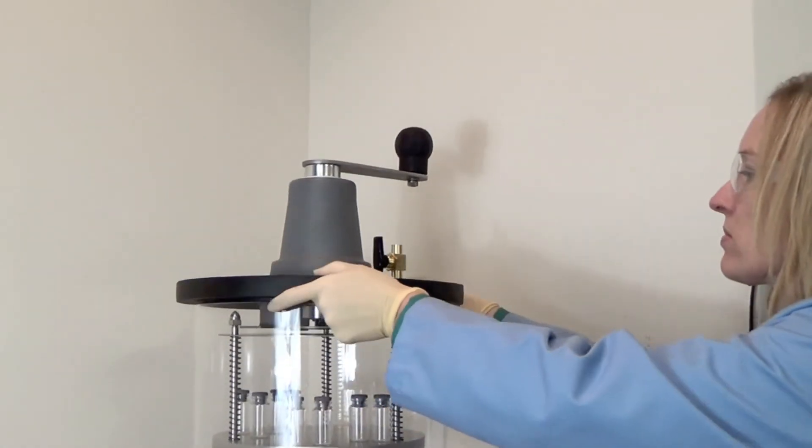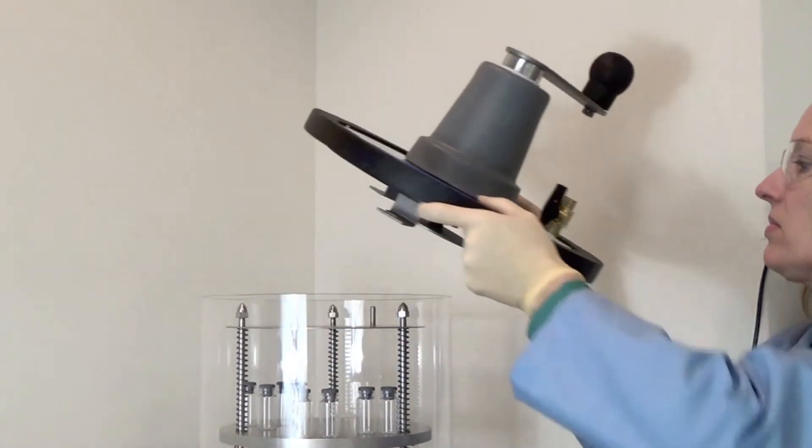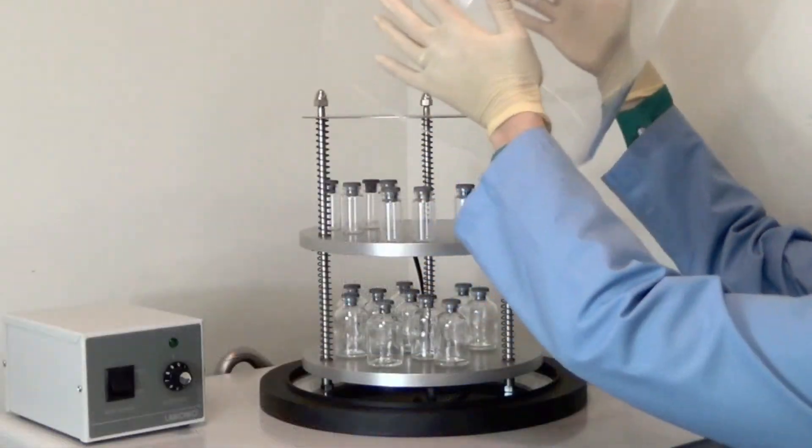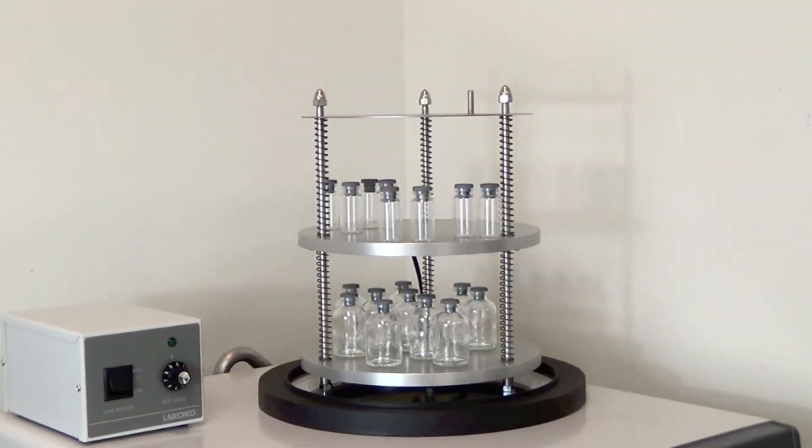Turn off the vacuum pump. Rotate the stoppering assembly counter-clockwise to remove it. Remove the clear chamber to gain access to your stoppered lyophilized samples.